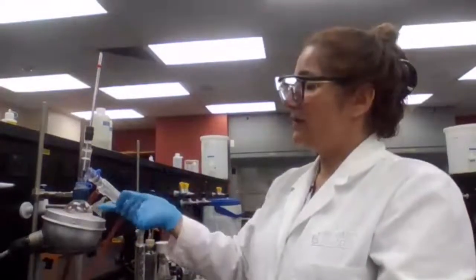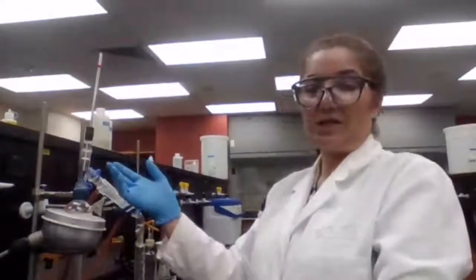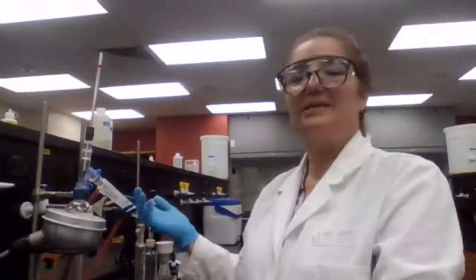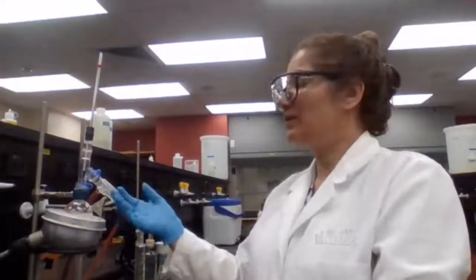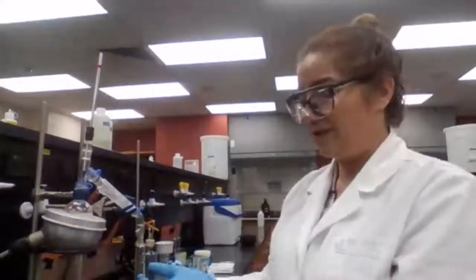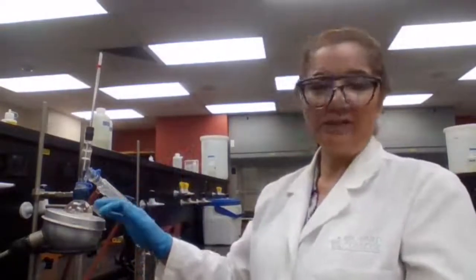The other problem was the problem of bumping, which we talked about in the second experiment. Bumping means the liquid goes over without changing to vapor. So if it's too low, it's not going to boil. We need vapor because it's distillation. We have to change the liquid to vapor, then condense the vapor to go back to liquid. So if you don't provide heat, it's not going to vaporize, and we do need the vapor. So we have to look for gentle boiling.